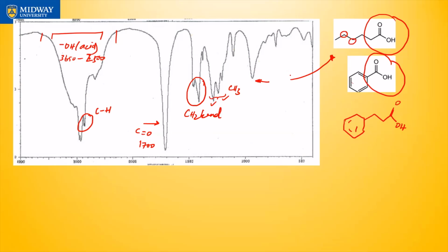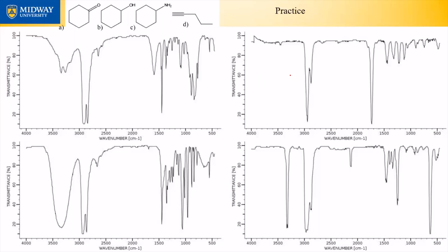And that's it. So I'm going to leave you with 4 spectrums and 4 molecules. Your job is to identify which one is which using just the table. Like I said, use the left-hand side of each graph. It has more valuable information than the far right side, and you will turn this in as an activity in class, right? So that's it. We're done with infrared. Stay tuned.